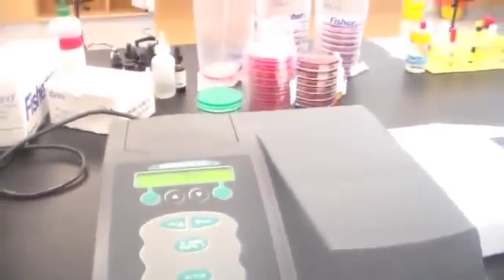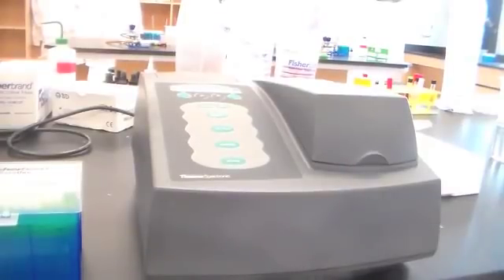So the principle here is that the more bacteria there are in that broth, the less light will pass through. More light will be absorbed. So the bacteria absorb the light, they scatter the light, and as these absorbance numbers get higher, that's an indication that the bacterial culture is more dense. It has more bacteria per mil. So that's one way to determine how many bacteria there are per milliliter in a culture. You're actually going to establish an equivalency. You're going to calculate how many bacteria per mil it is for each one of these absorbances.